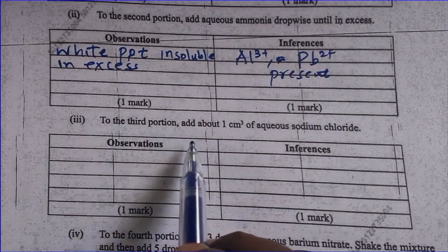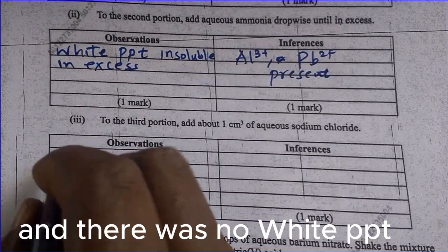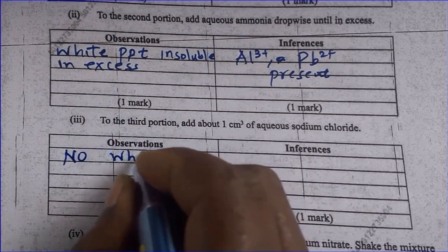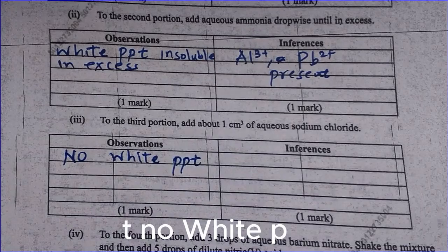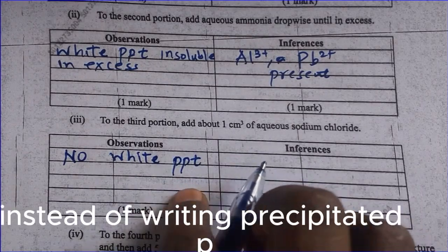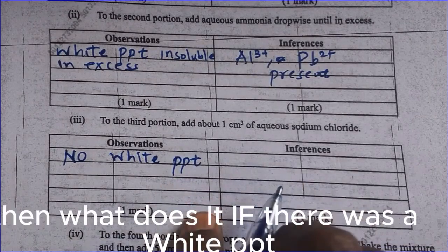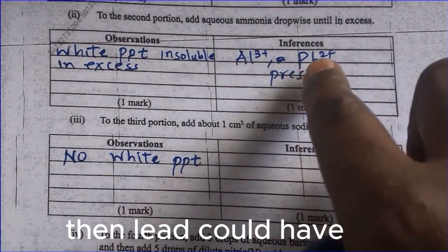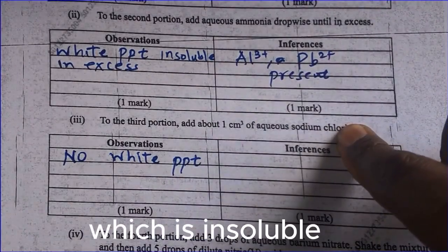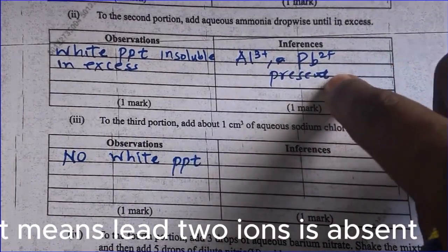The third portion, add 1 centimeter cube of aqueous sodium chloride, and there was no white PPT. You simply write no white PPT. PPT is allowed even in KCSE, so don't worry. PPTs are precipitate. Instead of writing precipitate, PPT is allowed. If a white PPT was formed, then lead could have combined with chlorine to form lead chloride, which is insoluble, and it could form a white precipitate. Now that there is no white precipitate, it means lead 2 ions is absent.